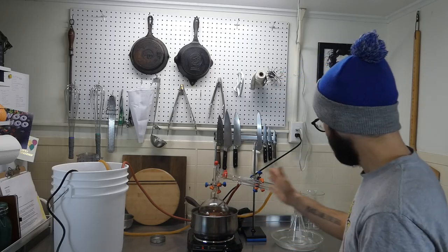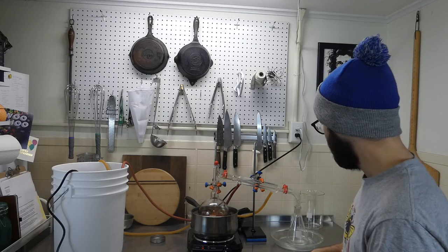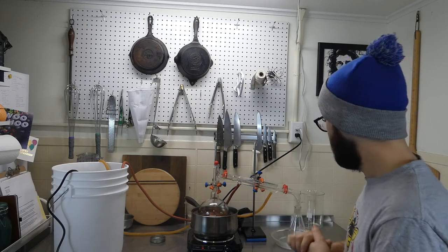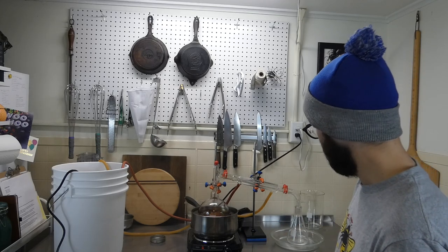With how fast this is distilling, this is not going to take long. Maybe 45 minutes to an hour max, maybe a little bit more, I don't know. But I think it's going to go quite fast. So we'll come back when this is almost done.